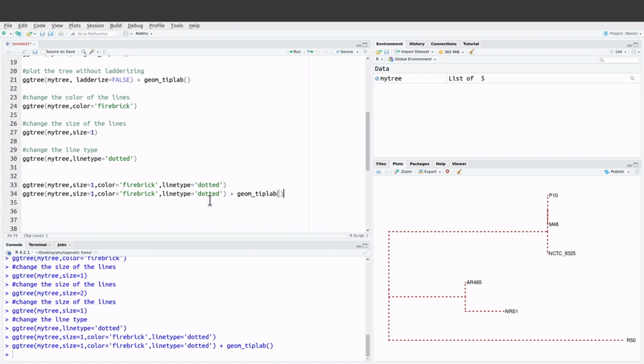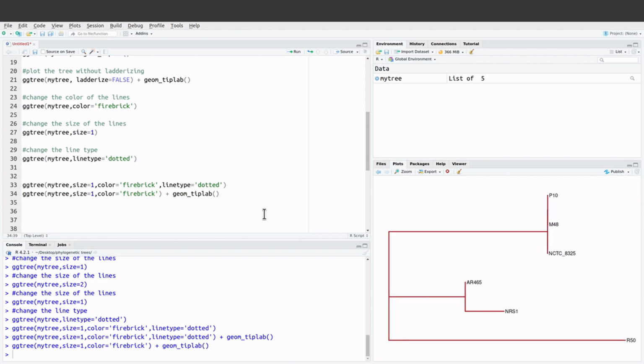Make sure you get your hands dirty with R programming. Let's remove this. You can also use two options. So we'll do this to get this. So just try. These commands are there. So you just have to look at what works best for you, or what you prefer, and then make the changes. That's all that you need to know. So let's continue.